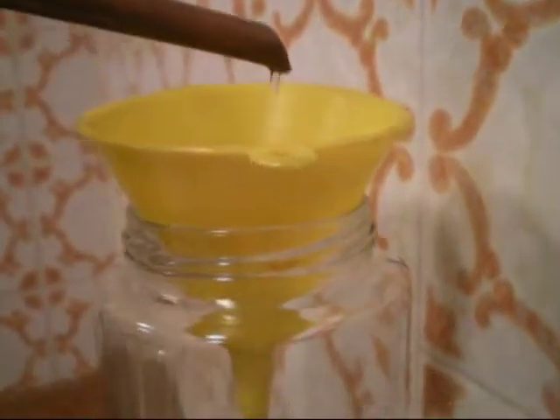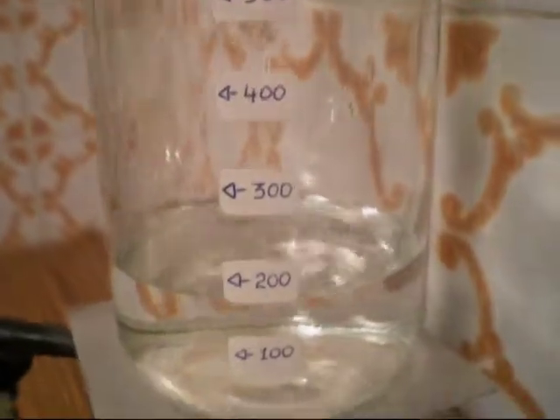That vapor is then cooled by a condenser back into a liquid which flows into a collection bottle.